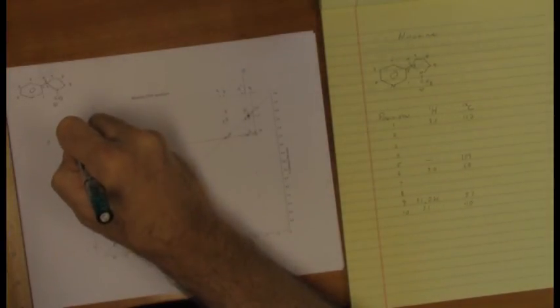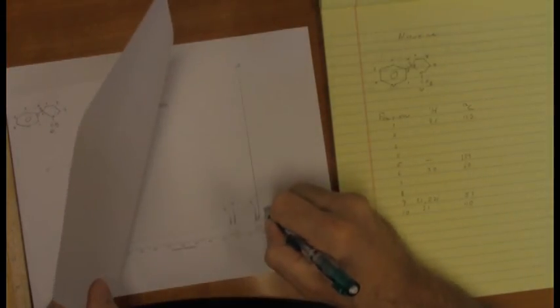Now, once I have that worked out, and that looks to me like approximately 1.7 or so ppm, I'll verify that over here. That is one of the protons at position 8. Yeah, I'm going to call that 1.7.